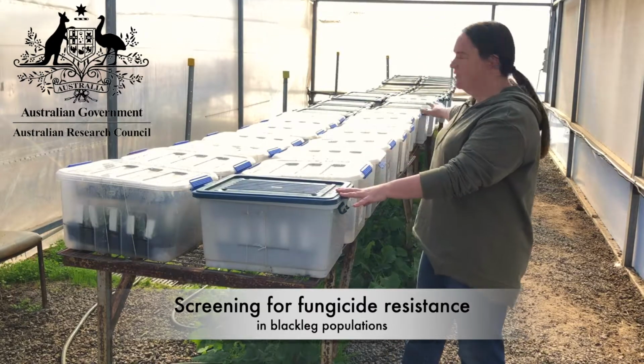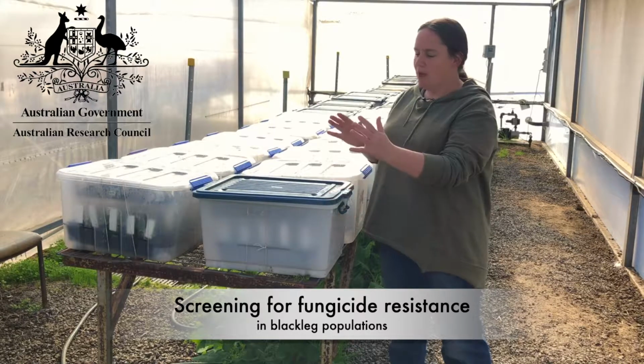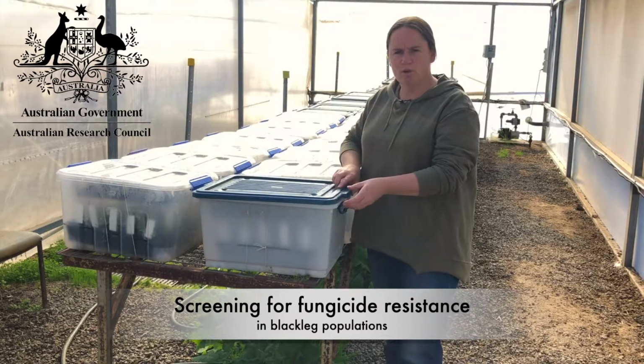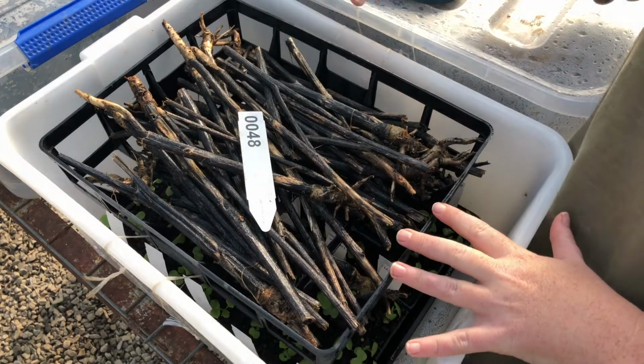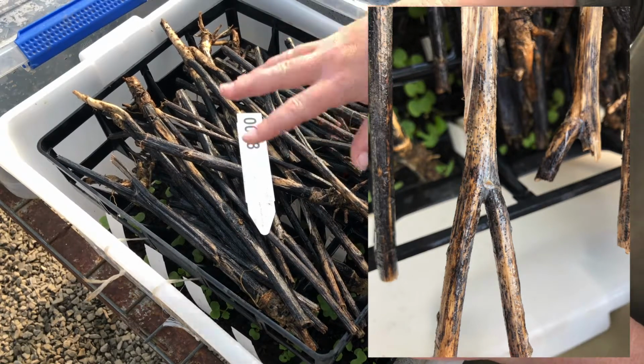So we do that using these tubs. Each one of these tubs is an individual population, and we take the stubble and we use that to inoculate the plants. So I'll just show you what that looks like. For each of the populations, we have a set of stubble. This stubble is then matured in the field before we bring it in and we wet it up.